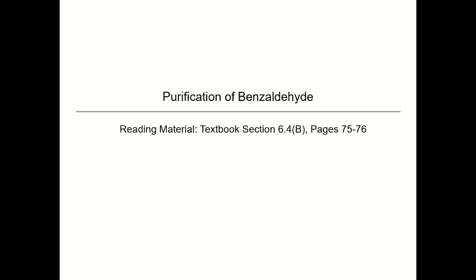Today we have our first theoretical lab for Organic 2. Today specifically we are going to perform a purification of benzaldehyde. This is the bibliography that you may take to study for the quizzes and to go to if you have any doubt regarding the experiment itself or the theory behind the experiment. You can also ask me, right?